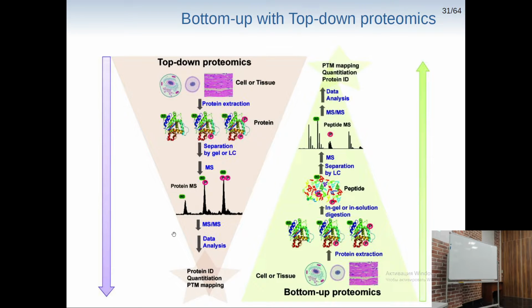So the difference is whether we can get all proteins, then trypsin them, and then work on the peptide level, which is actually the most usable way. We can get a good coverage, but lose some post-translational modifications and sensitivity.